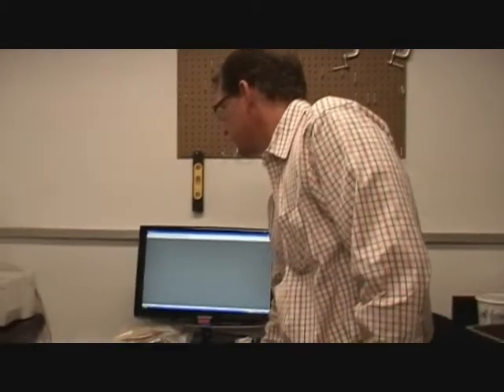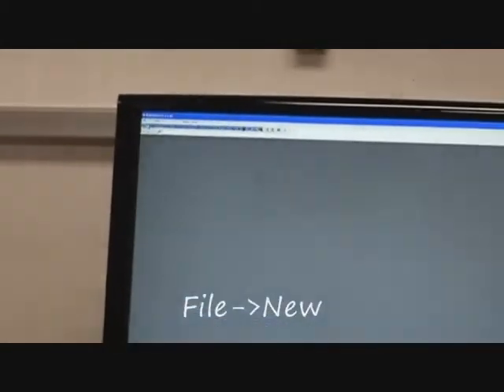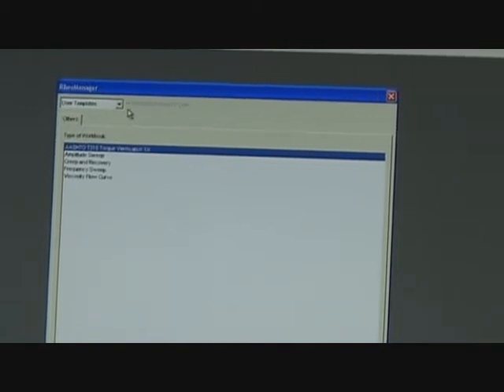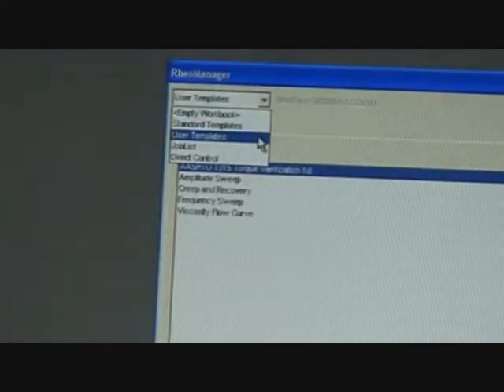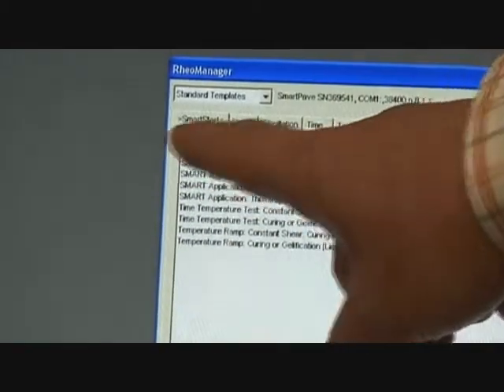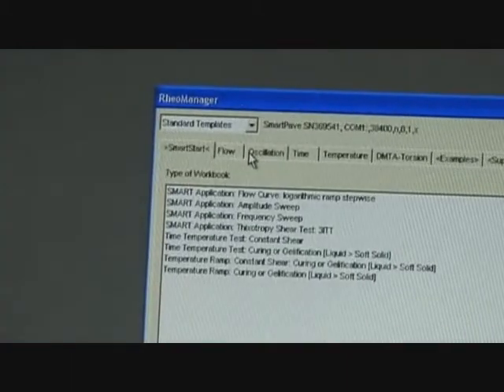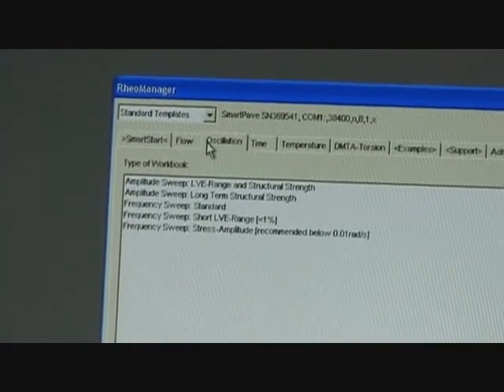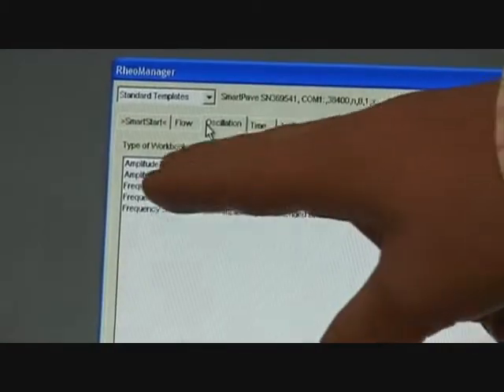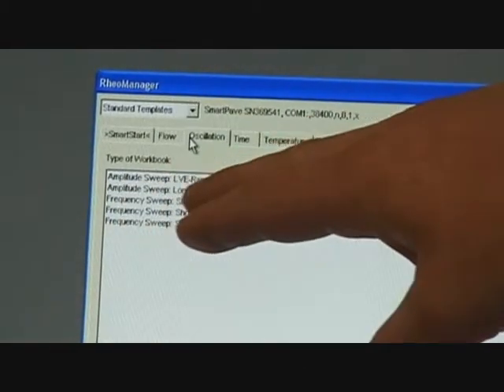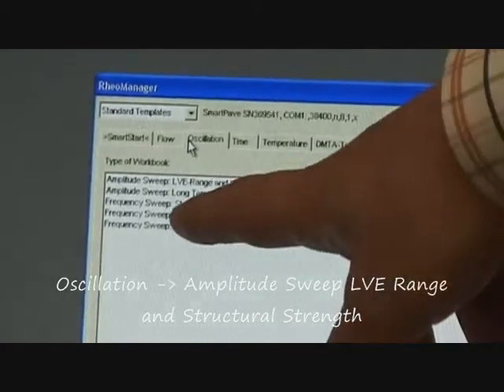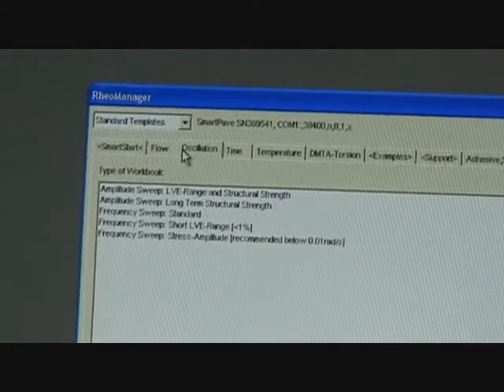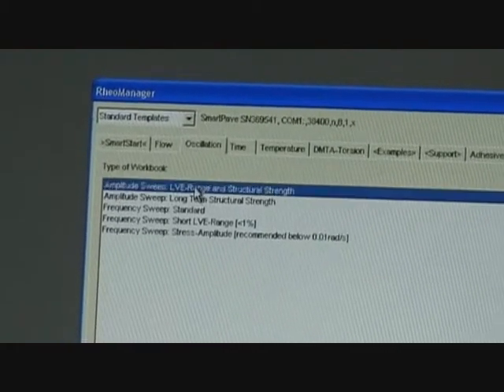One thing I can do is come over here and click File > New — that's the same thing as hitting this little white sheet right there. What that opens up is our RheoManager. In the RheoManager, there's this little drop-down box. I can select standard templates, and when I do that it opens up a whole bunch of tabs. I know an amplitude sweep is an oscillatory test, so I click on the oscillation tab. You see there are amplitude sweeps, frequency sweeps, amplitude sweep linear viscoelastic range and structural strength, and a long-term version. I can just click on one and say okay — it will open up that template.